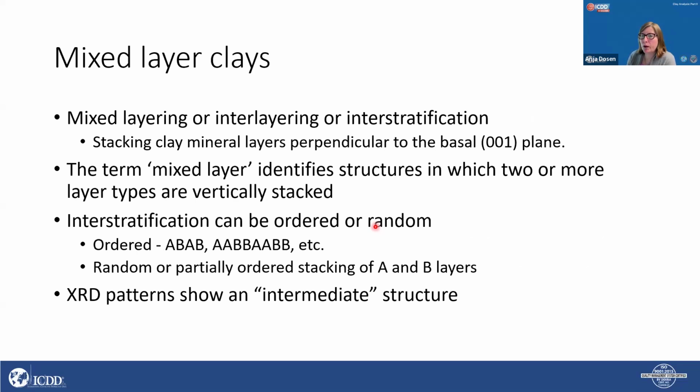Besides having preferred orientation and being sheet-like structures, clays are also very often interlayered. We call this interlayering or interstratification, which means that clay layers are stacked along their basal planes, and we have these mixed layer structures that contain 2 or more clay types.